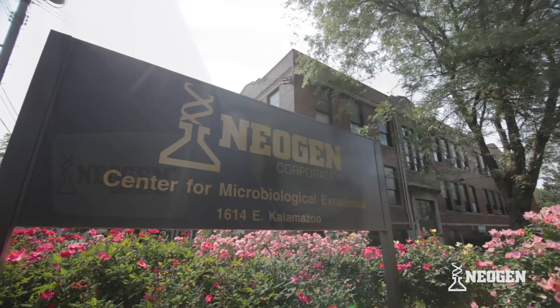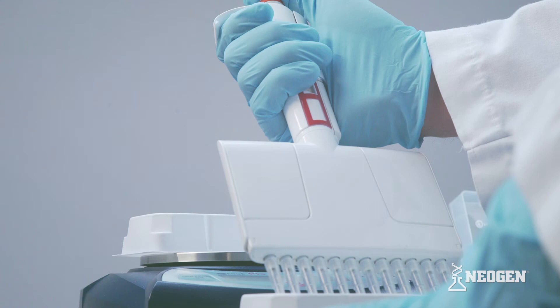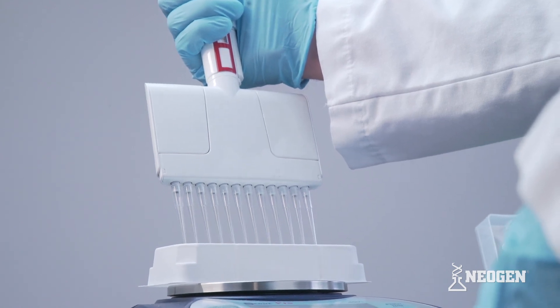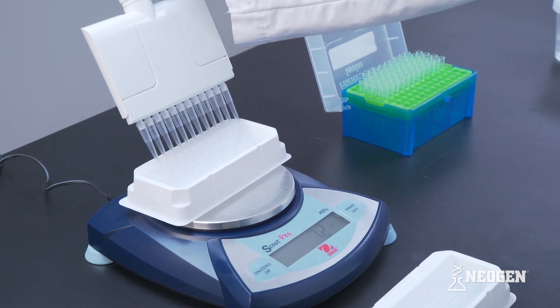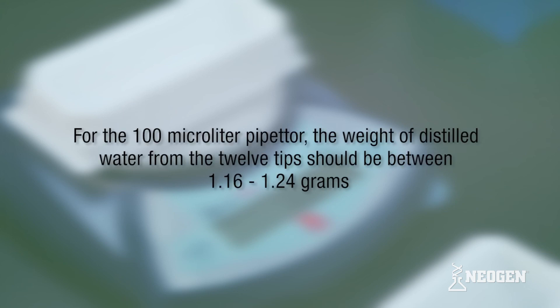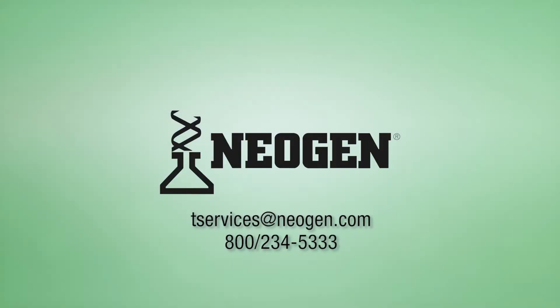Neogen recommends calibrating your pipetters once a year. New pipetters come with calibration certificates that are good for one year from the date of first use. Pipetters can also be checked for calibration by following the pipetting steps mentioned earlier — checking calibration is also a good way to practice pipetting. To check calibration, using either method described, pipet one draw of all 12 tips at 100 microliters of distilled water into an empty reagent tray that has been zeroed out on a scale. For the 100 microliter pipetter, the weight of the distilled water from the 12 tips should weigh from 1.16 to 1.24 grams. If the weight is outside of this range, the pipetter should be sent in for calibration. Neogen offers calibration services and all of the products shown in this video — please contact your Neogen representative to learn more.